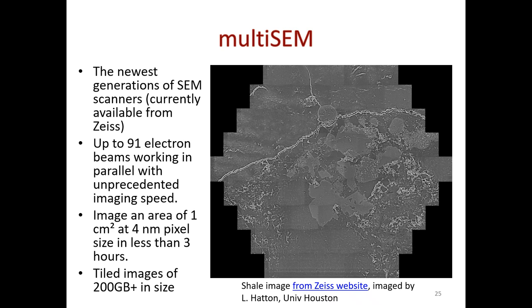Technically, there is no material change from this side to this side. Whatever mineral this is, it seems to me it's the same mineral. Look at it. Yes? Same crystal structure here. This is the same mineral, however, I have two shades of gray. As we will see when we start analyzing, in any kind of analysis, I assume that the same shade of gray is the same type of material, plus or minus some variation. And this can create problems.